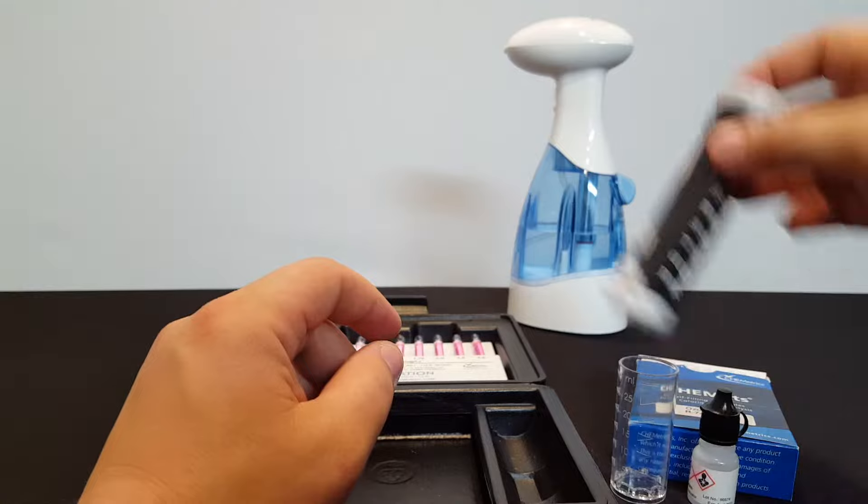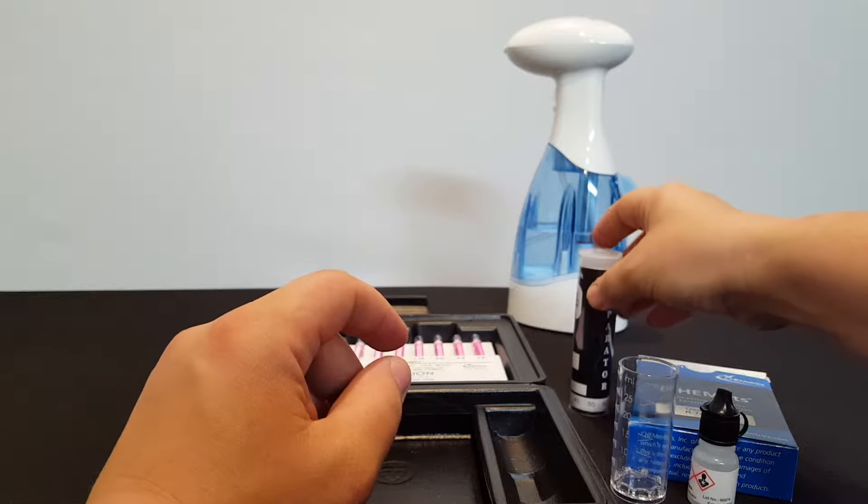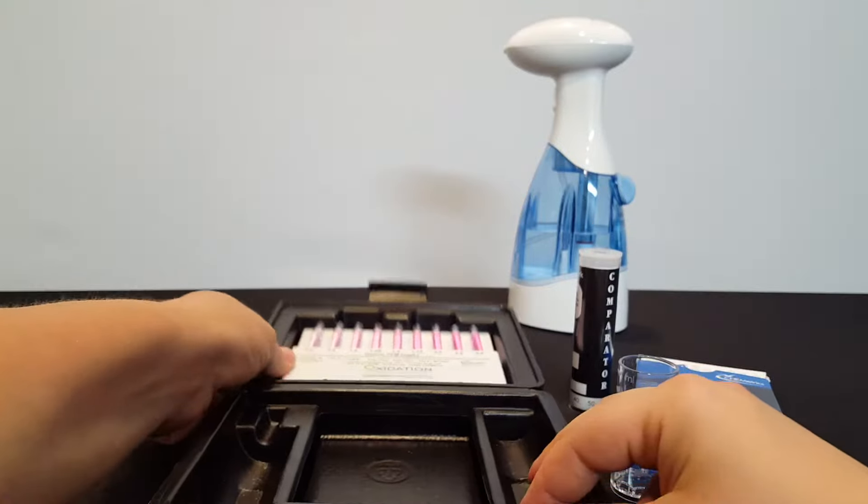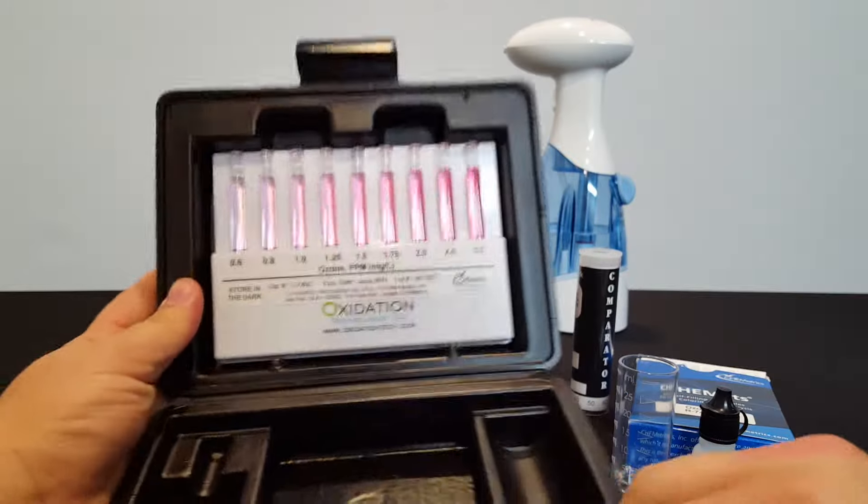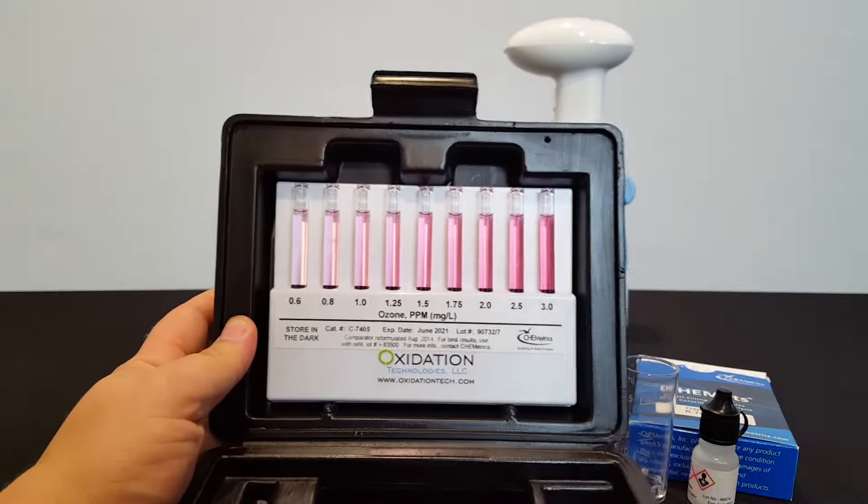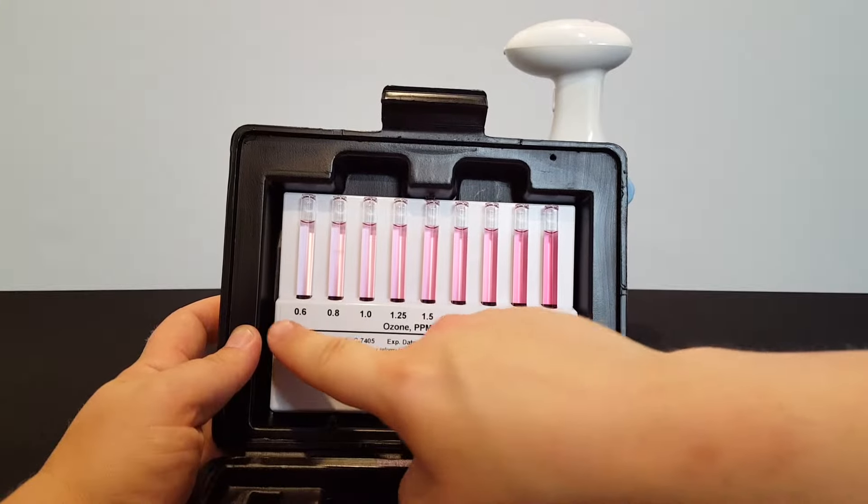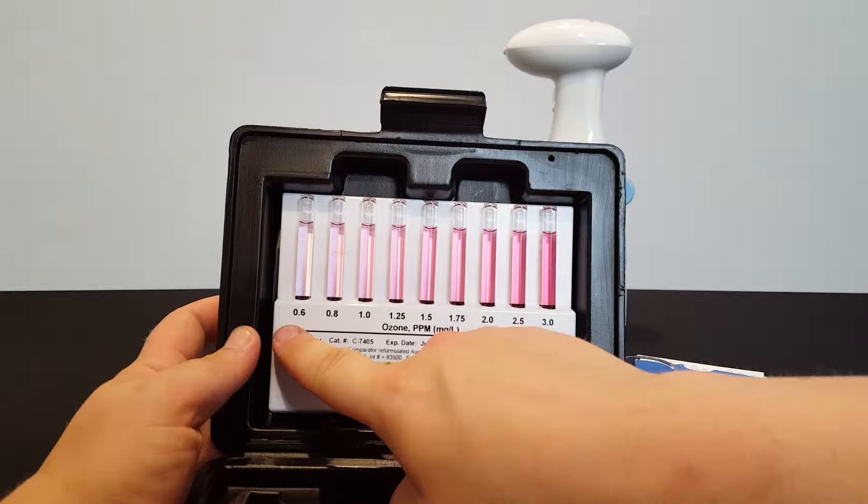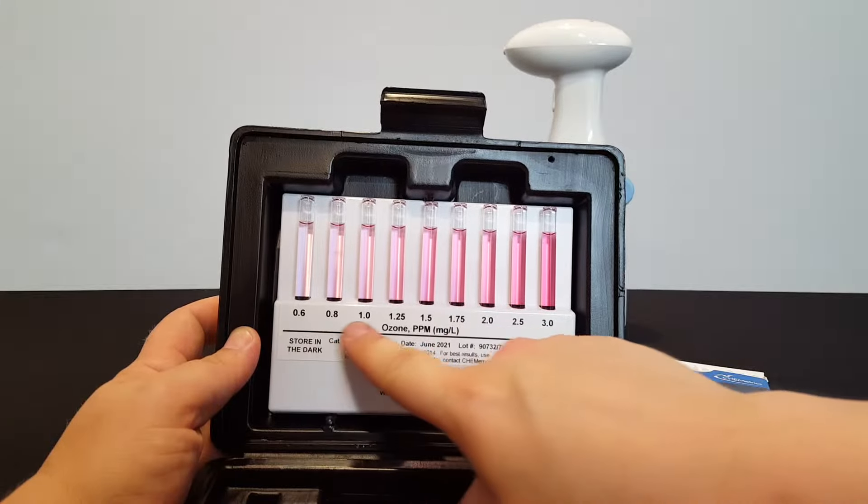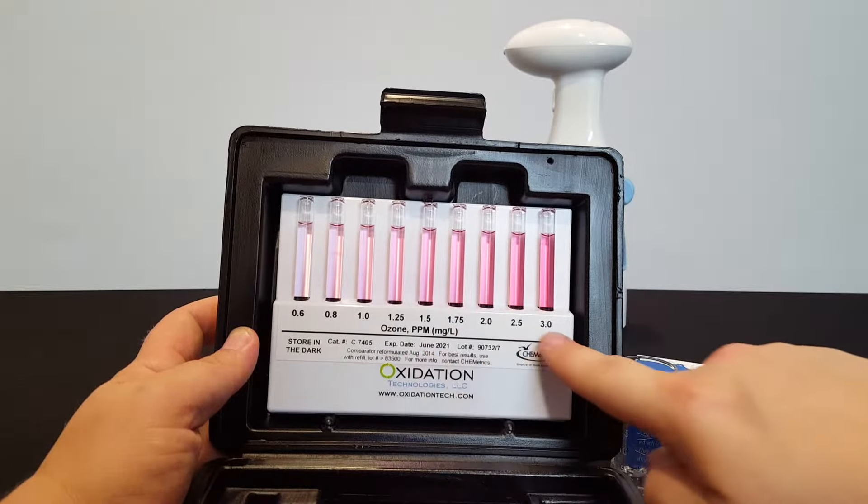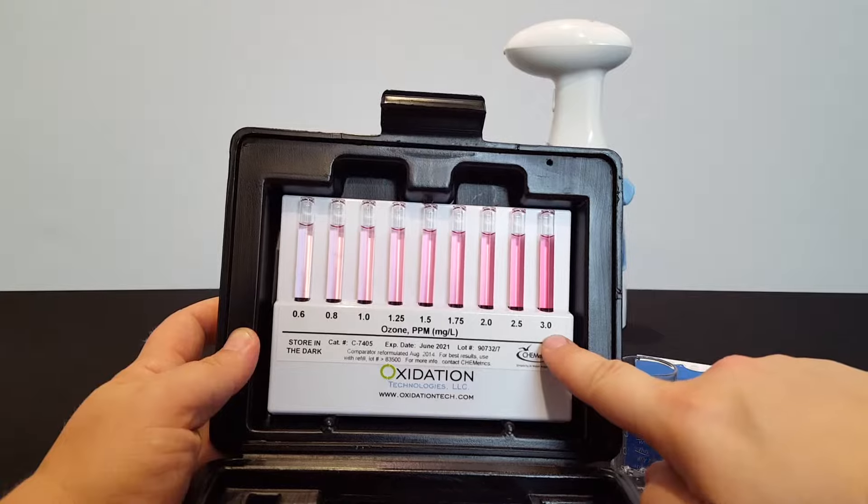If your dissolved ozone is higher than 0.6 parts per million, you'll move on to the higher level comparator, which starts at 0.6, where the lower one leaves off and goes up to 3 parts per million.